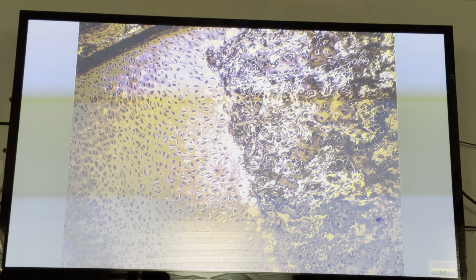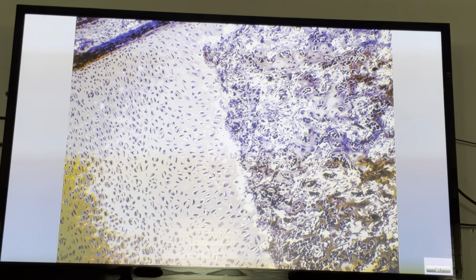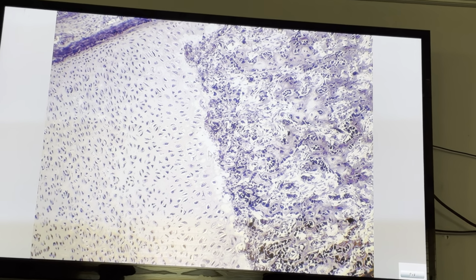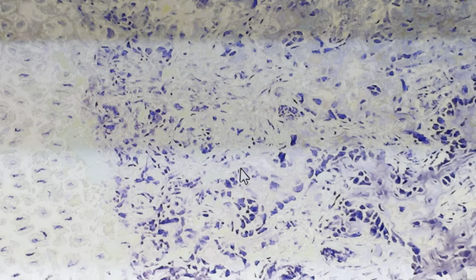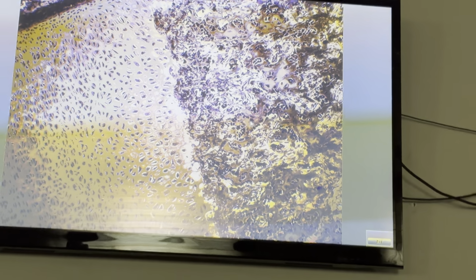The fourth zone is called calcified zone. Chondrocytes are dead by apoptosis. Calcified zone. The last zone or the fifth zone is the ossification zone. In this zone we can see the bone tissue, bone trabecula with matrix and osteoblasts. Ossification zone, the presence of bone tissue.